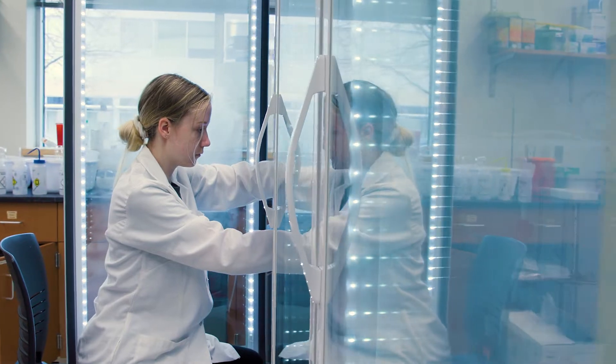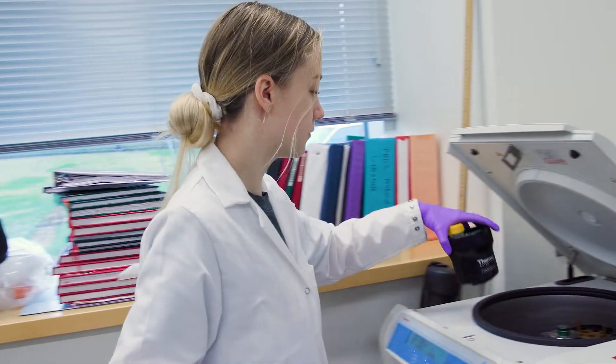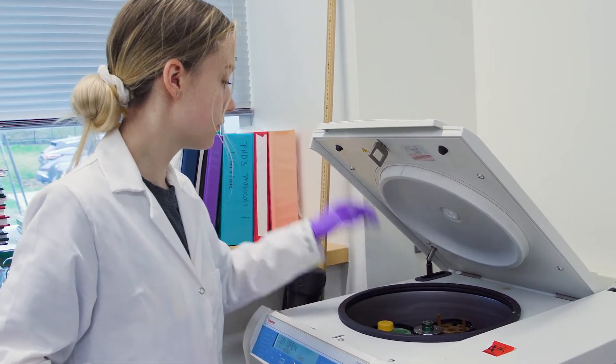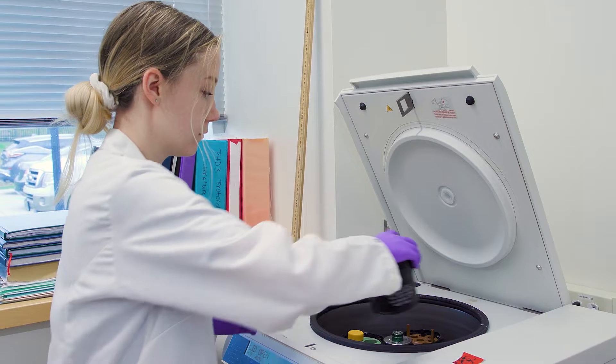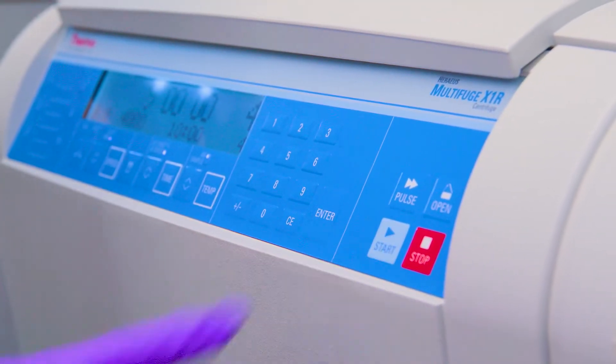I mainly work on protein purification and studying the thermodynamics of different proteins. I most recently worked on the purification of the SARS-2 main protease, and I basically do that by going through a series of steps over multiple days.